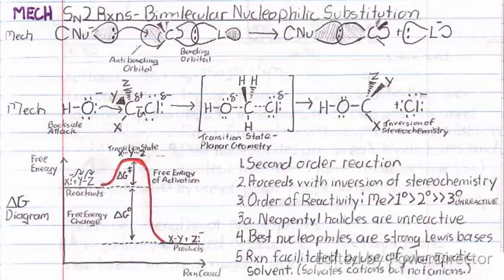In this video, I will be demonstrating the synthesis of diiodomethane from dichloromethane using the Finkelstein reaction, or Finkelstein. I'm not exactly sure how it's pronounced. He was German, so maybe one of my Deutsch viewers can school us on how you actually say his name. I imagine it's like Einstein, Finkelstein. I don't know. Anywho, this reaction is an SN2 reaction, so it is a bimolecular nucleophilic substitution reaction.